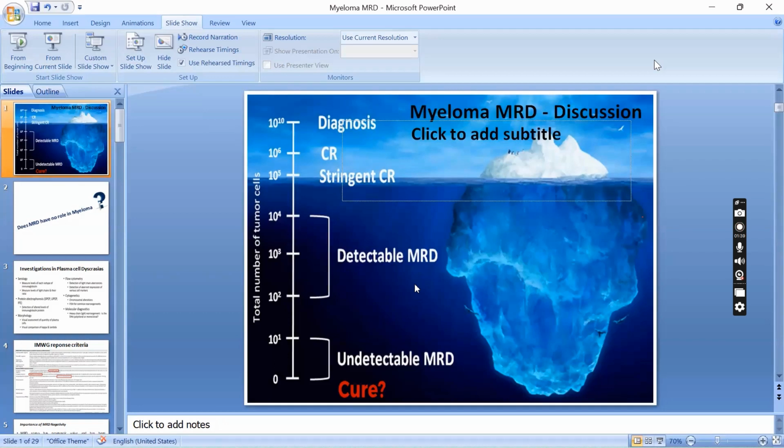Yes, sir, please go ahead. No, that is the reason: you are also removing all the interfering substances. So what you get is good cells that you can stain and then acquire. For this, you have to essentially use Versalyse or you can use Optilyse.